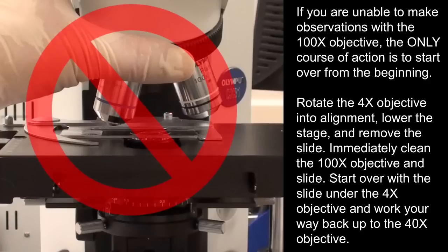If you are unable to make observations with the 100x objective, the only course of action is to start over from the beginning.